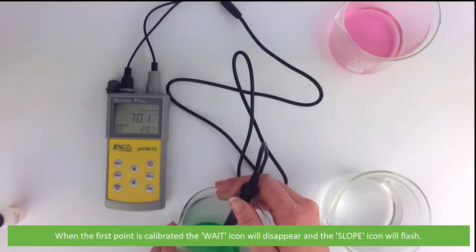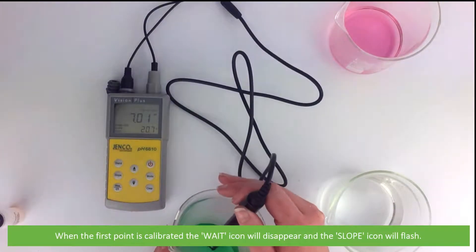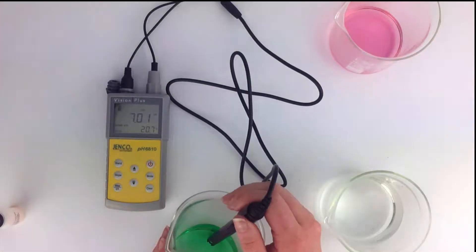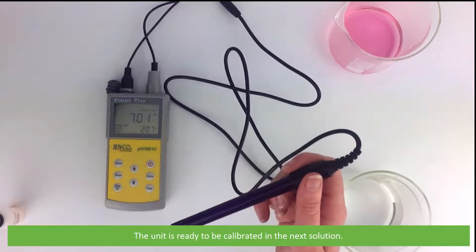When the first point is calibrated, the wait icon will disappear and the slope icon will flash. The unit is now ready to be calibrated with the next solution.